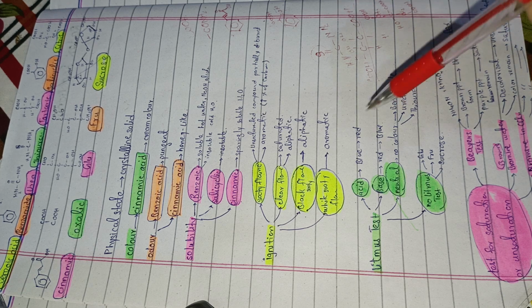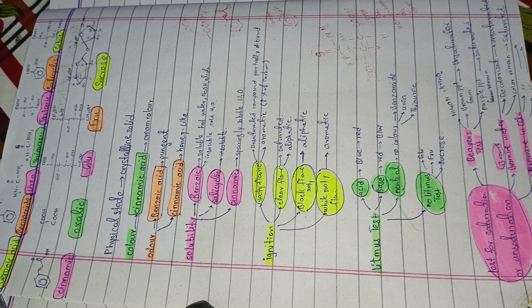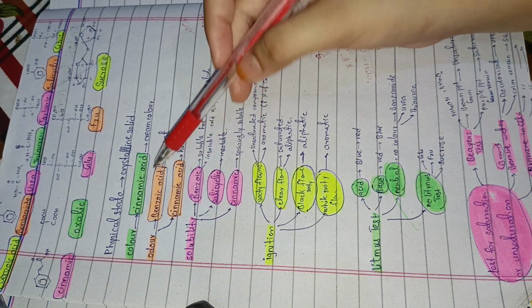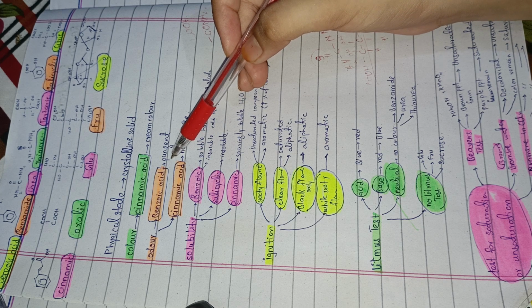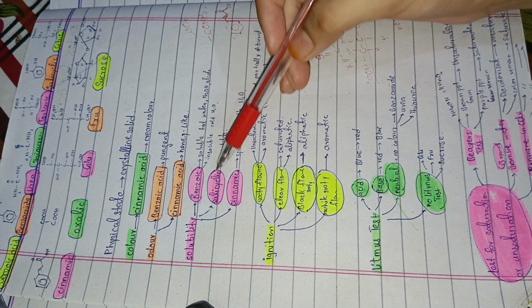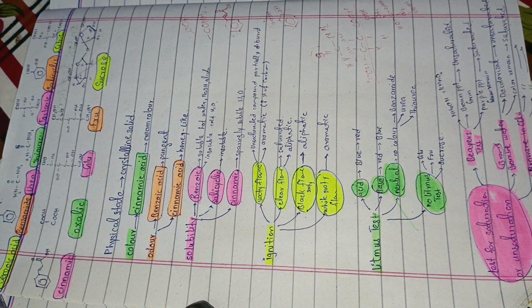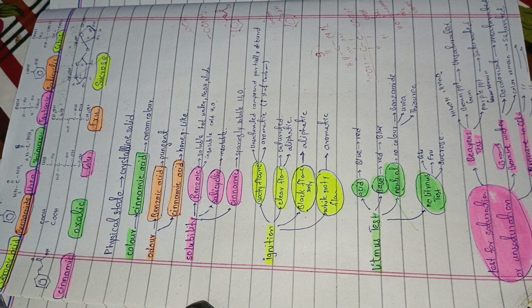Okay. So for solubility, you again have to remember three compounds: benzoic acid, cinnamic acid, and salicylic acid. The exception of benzoic acid and cinnamic acid also occurs in the odor, but in solubility another addition occurs, salicylic acid. So salicylic acid is totally insoluble in water.